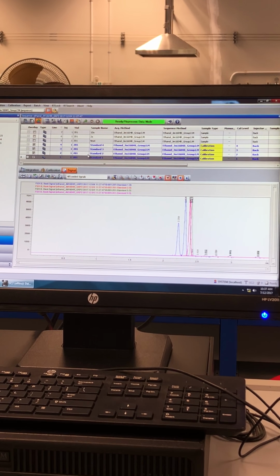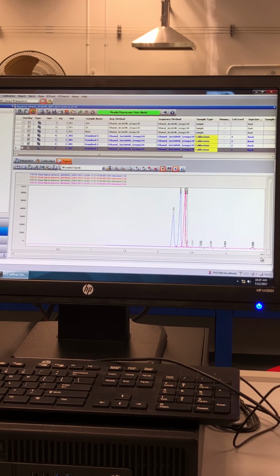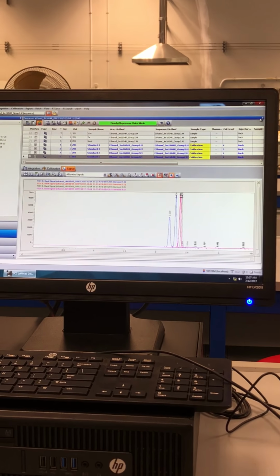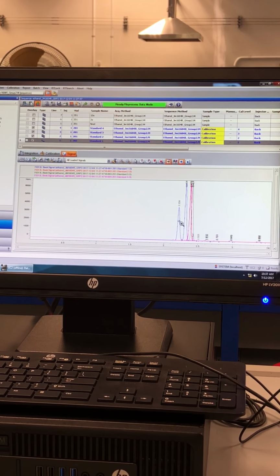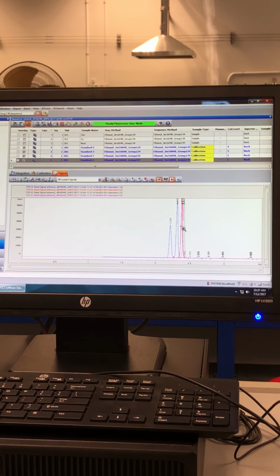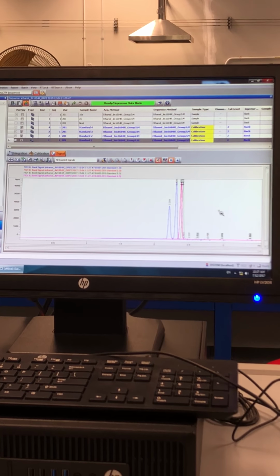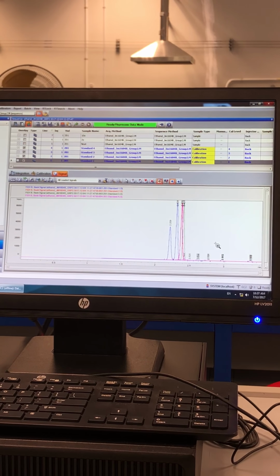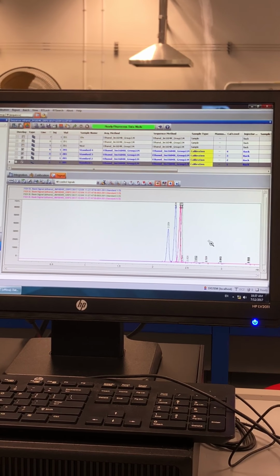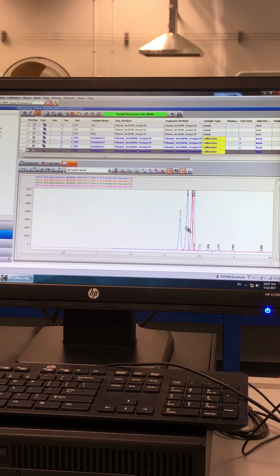Did you see on the chromatogram that there's actually an overlay? If you see a mesh of lines, do you see the pattern of increasing peaks? You never see, right? Almost all the peaks are at the same height. So this is a rubbish image. So how do you make it nicer?